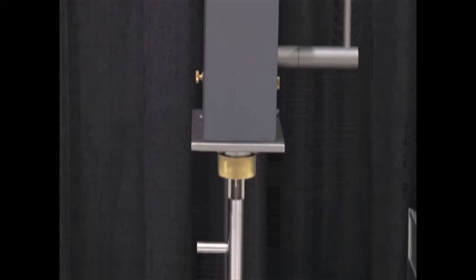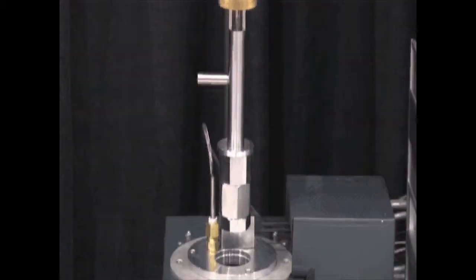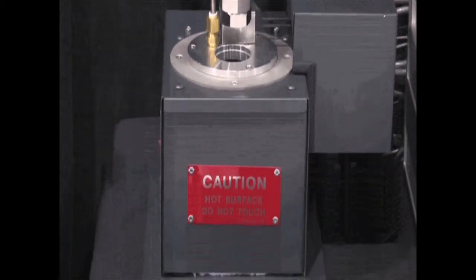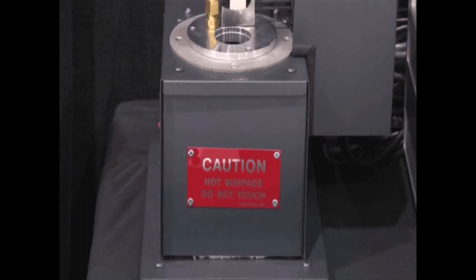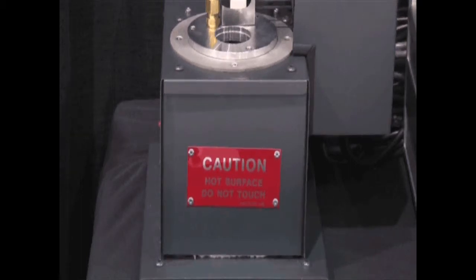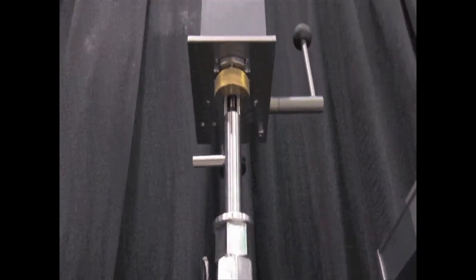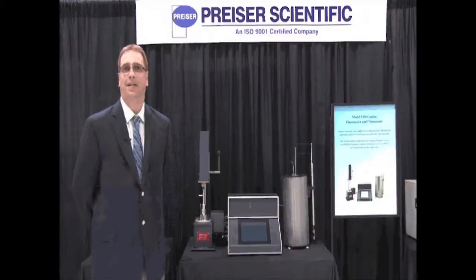The plastometer is used to determine the plastic characteristics of the coal. You put a sample of coal into the furnace at a fixed torque and motor speed, heat it up over a temperature range of 300 to 600 degrees. As the sample heats up it actually starts to become fluid and what we do is we record critical points while the sample is fluid and then it will actually coke off or become solid at the end of the test.